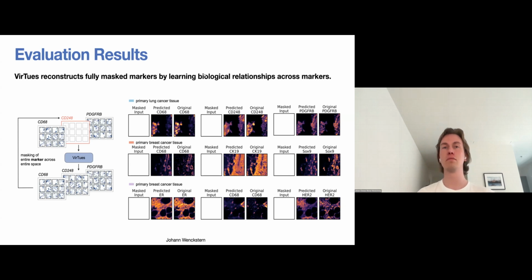That shows that the prediction performance of markers depends on the markers and is limited to some degree, given that we have only a snapshot view of 39 other markers. So it learns a lot, but it doesn't learn everything basically. And this was also reflected by looking at the absolute reconstruction losses, which I'm not showing now because it's a bit overwhelming figure, but it shows that the reconstruction quality in these tasks is highly dependent on which marker you try to reconstruct.